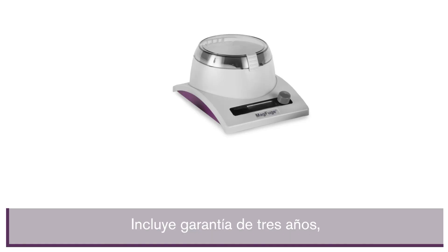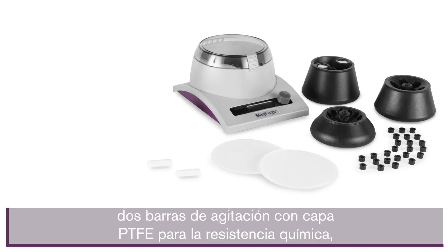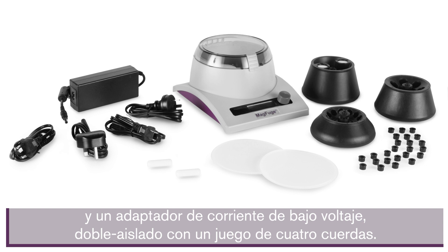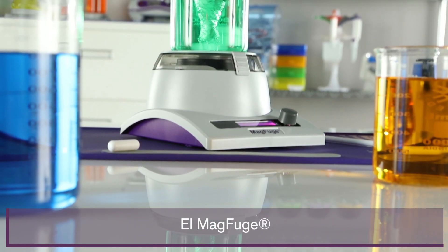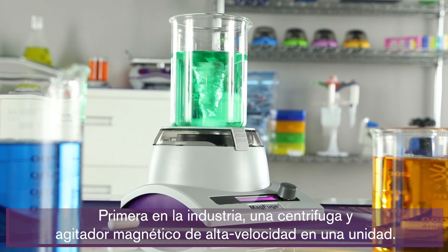It comes with a three-year warranty, three different rotors, twelve 0.2-milliliter tube adapters, twelve 0.5-milliliter tube adapters, two silicone mats, two stir bars with PTFE coating for chemical resistance, and one low-voltage double-insulated power adapter with four cord sets. The MagFuge — the industry's first all-in-one high-speed centrifuge and magnetic stirrer.